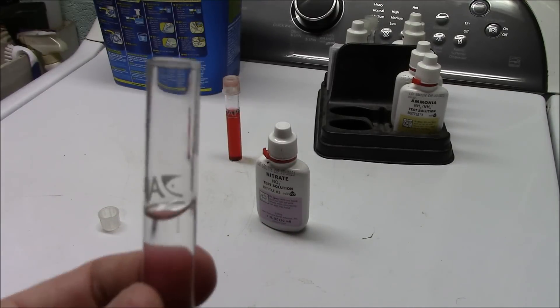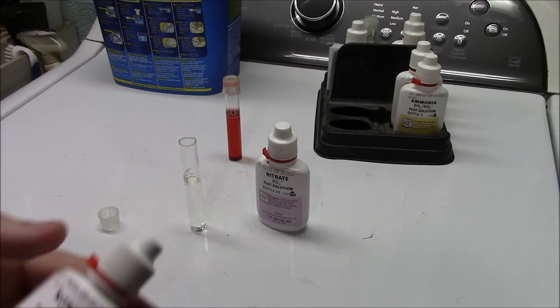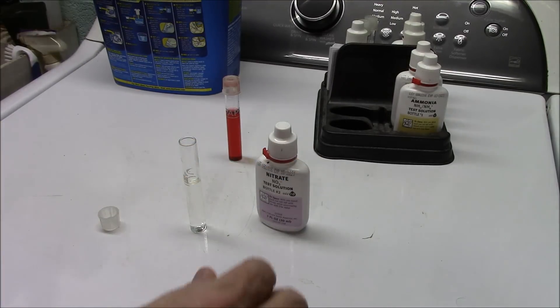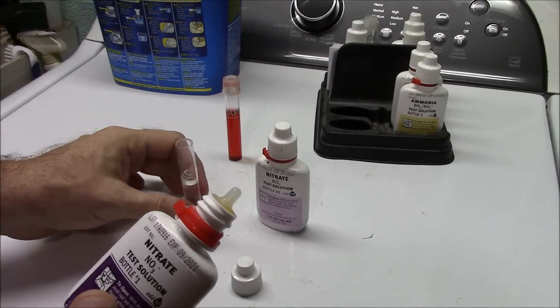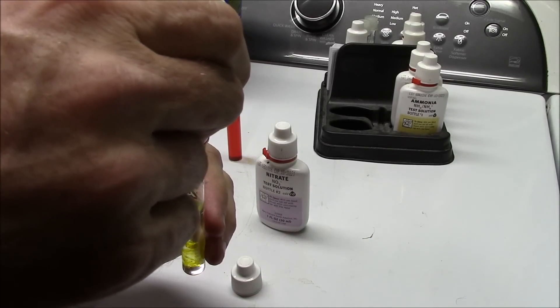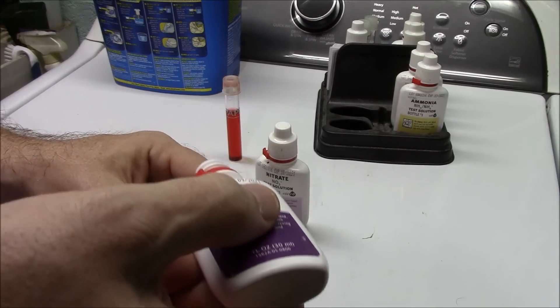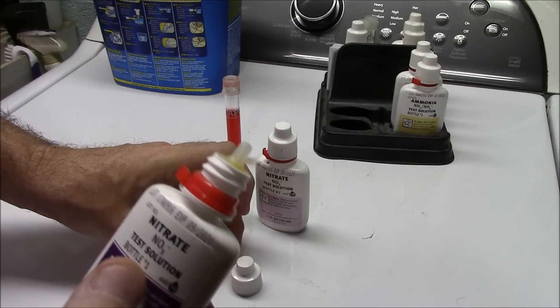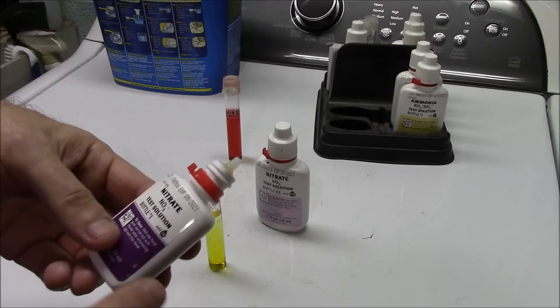Now that you've got your proper amount of water, simply open bottle number one — make sure you're using bottle number one, not bottle number two. Count out ten drops, and be careful not to touch the dropper tip to the glass. There's usually a drop hanging on the tip, and if you touch it to the glass you'll get an 11th drop in there. I'm not sure that would make a huge difference, but for accuracy sake be careful about that.